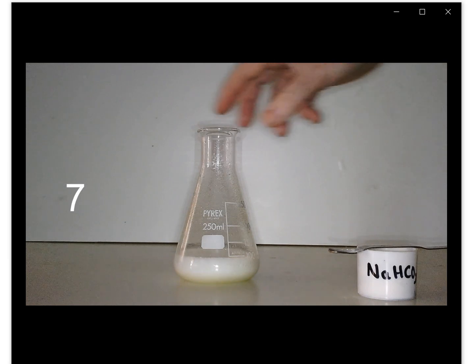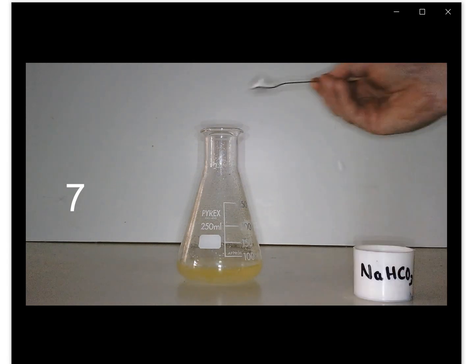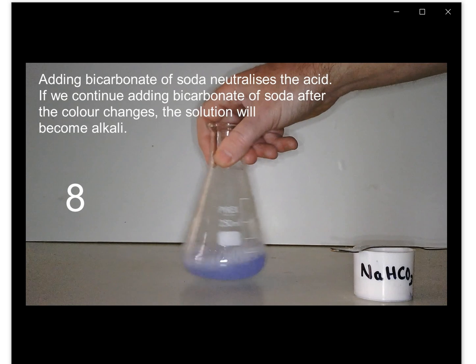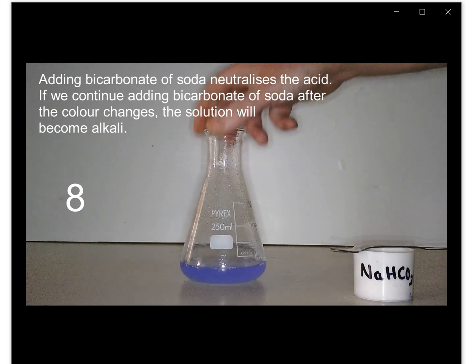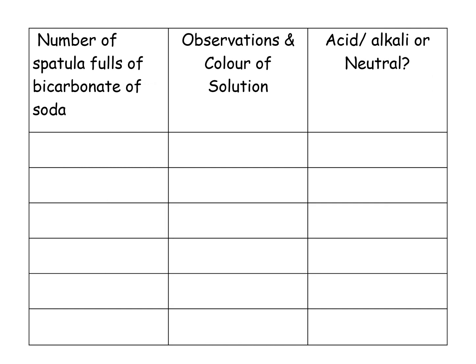7, still getting fizzing, bit of swell, we're still on yellow. Our spatula 8, less fizzing now, good swirl, and it's gone blue. So we've gone past neutral. So make sure you've got 0, 1 and 2 in your table, and 6, 7 and 8. And the colour and any other observations, and if that means it's acid or alkali. Okay, pause the video if you need to while you fill these in.